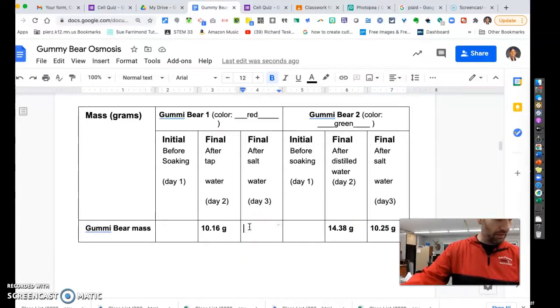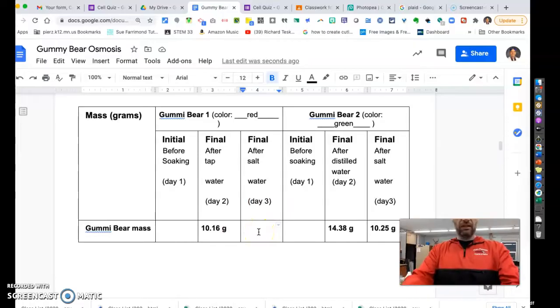Oops, I messed that up. I gotta zero this again, sorry. All right, and the red one is 8.58.